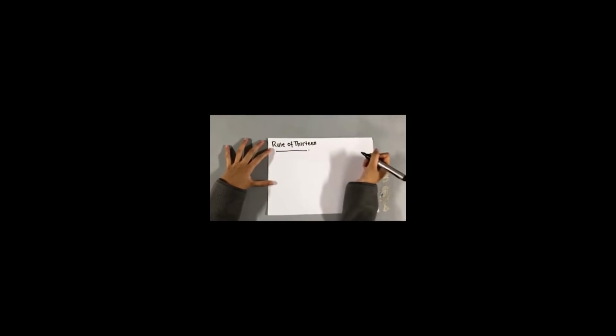So, to confirm that the molecular formula tallies with the spectrum, we use the rule of 13. Before that, we need to subtract the molecular weight by the mass of the heteroatom. So we subtract the molecular weight, which is 41, minus 14, and we get the value of 27.